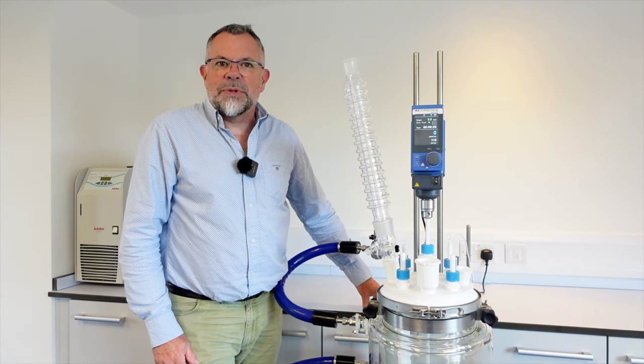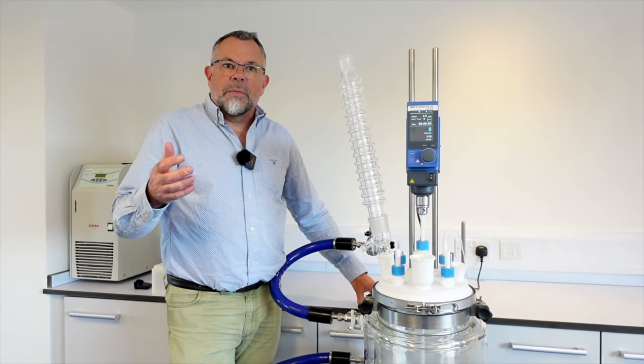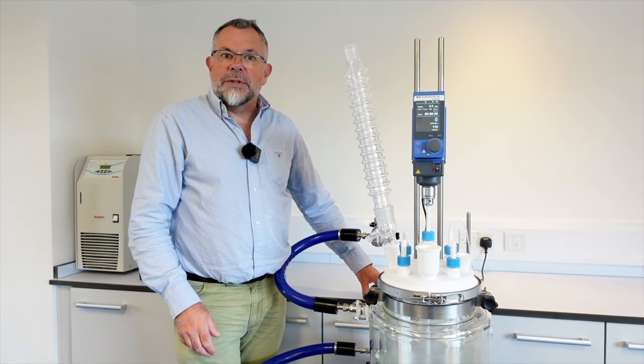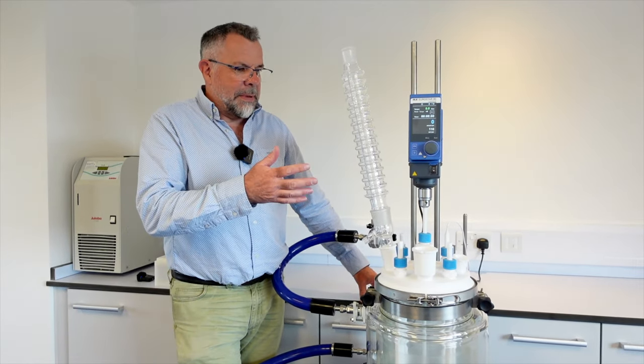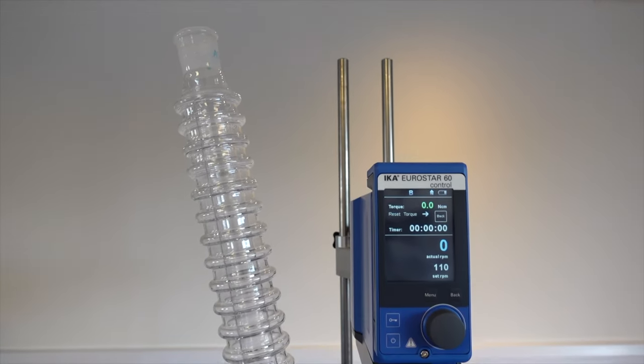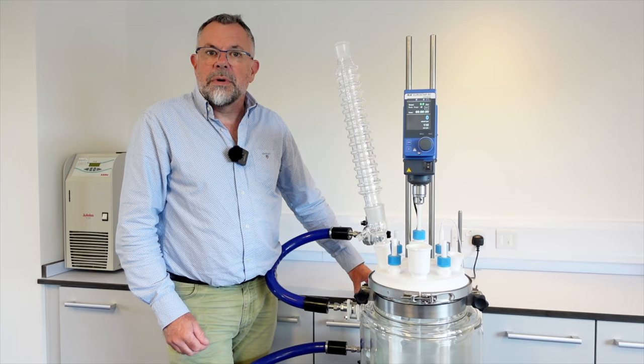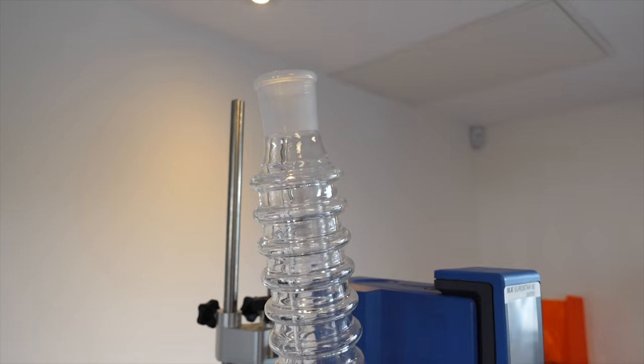Hi, I'm Martin and welcome to Asynt. I'd just like to give you a brief introduction to our newest product — this is Condensing Maxi. Condensing Maxi is basically a larger scale version of our very successful condensing waterless air condensers for reflux experiments in your synthesis laboratory.